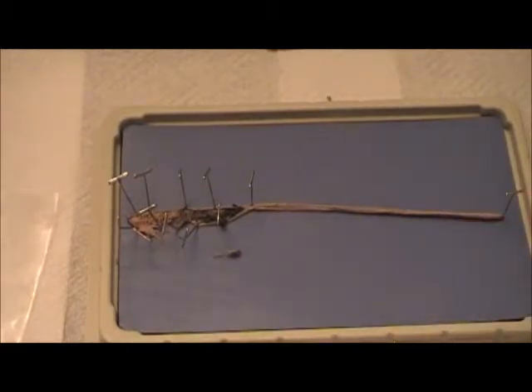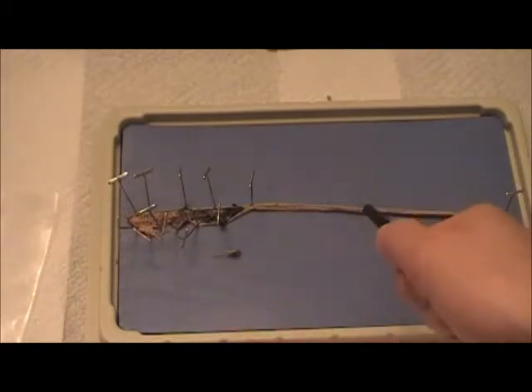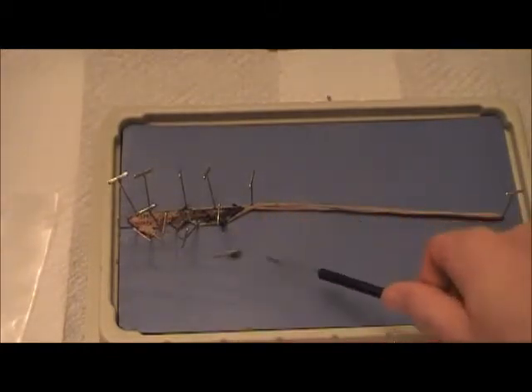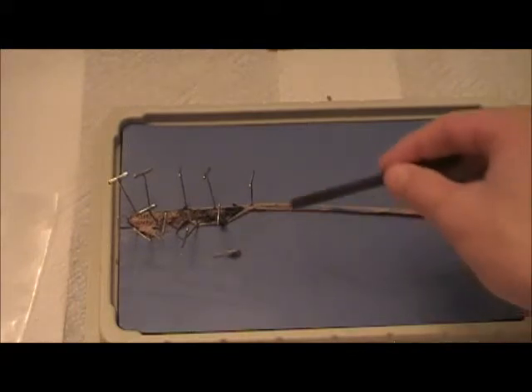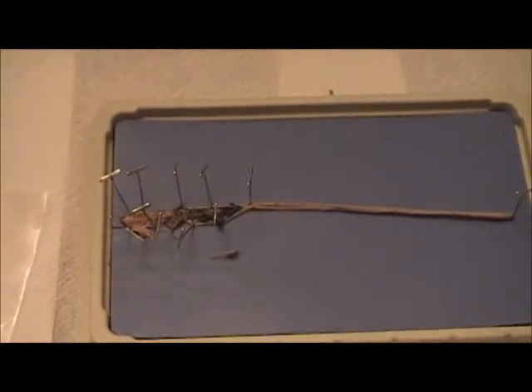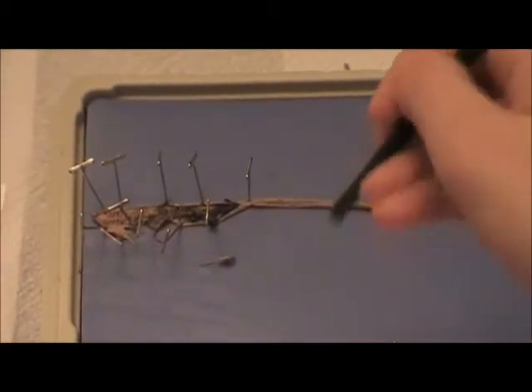So I hope this video helped. I know you probably couldn't see most of the other smaller things. That's just because this is my first time to ever dissect anything, so I had a lot of problems trying to locate everything and get it open. I had a lot of problems with the skin. So, yeah, I ruptured a lot of wrong things. But I will do this again. I'm going to get another worm. It's already on the way. So hopefully I'll make a part 2 with some more of the stuff I left out.